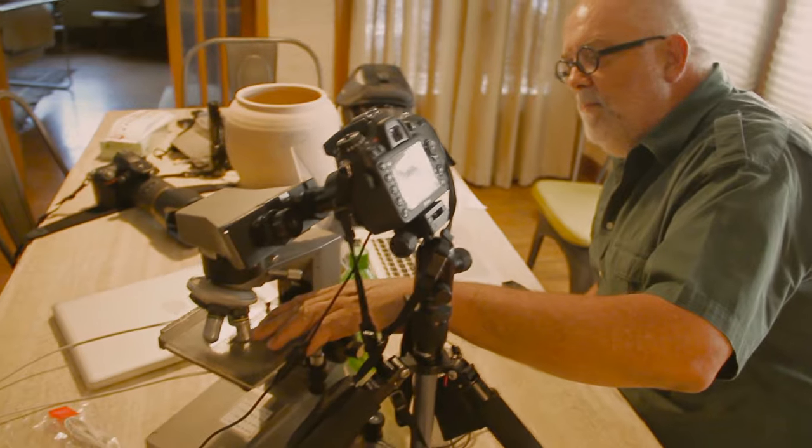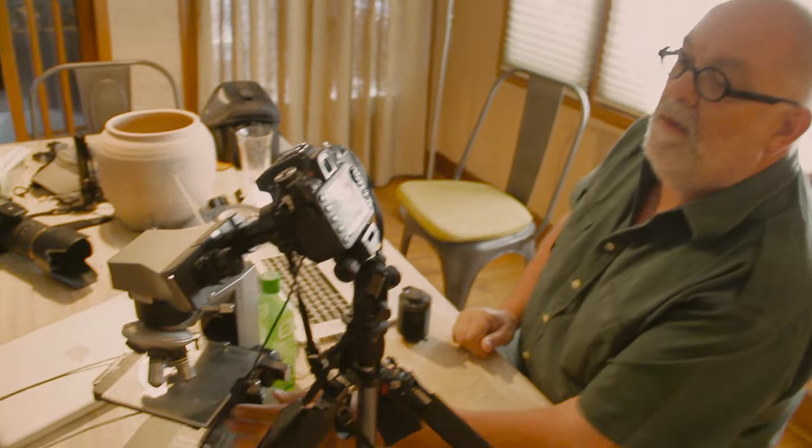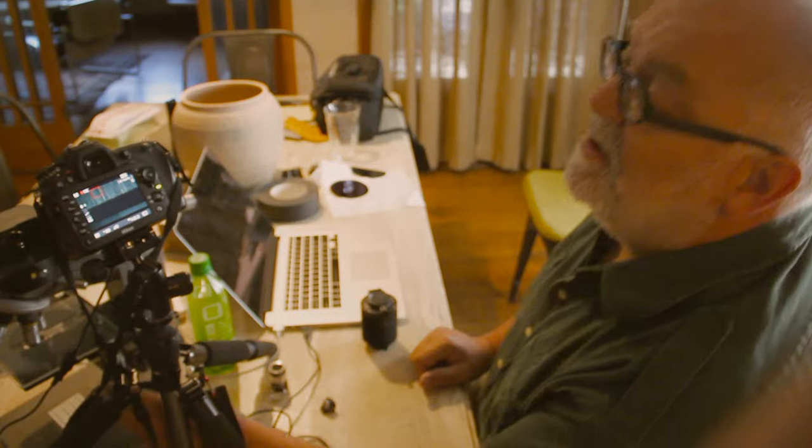So now we're going to put a razor blade under the microscope just to take a look. It's like a serrated knife — that's why they work so well. There are two things we're looking at: you see the scarifications, the lineations on there, and those are the main taper to thin it. Then there's a sharper taper on that to give it the razor edge, and that's in the shadow.